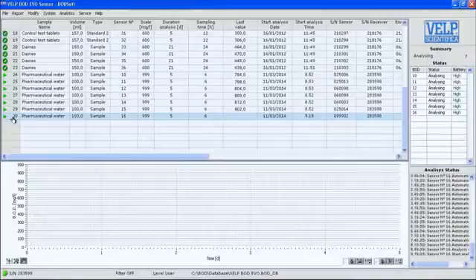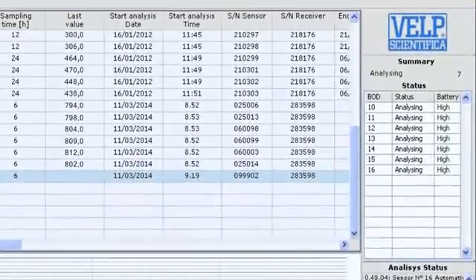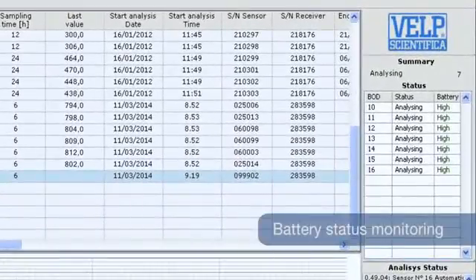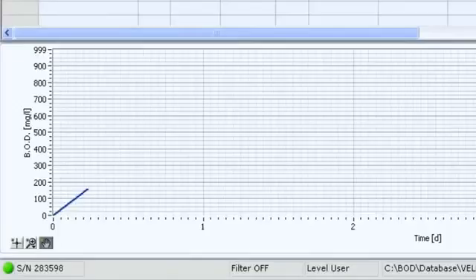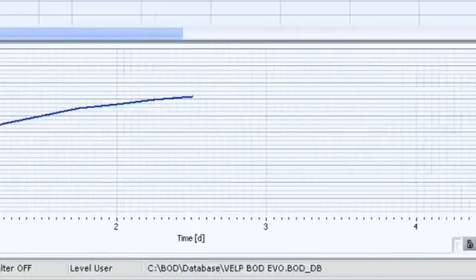All the most important information is constantly shown, including the status of the sensor's batteries and a database with automatic real-time graph creation.